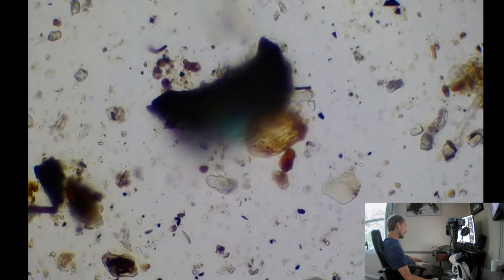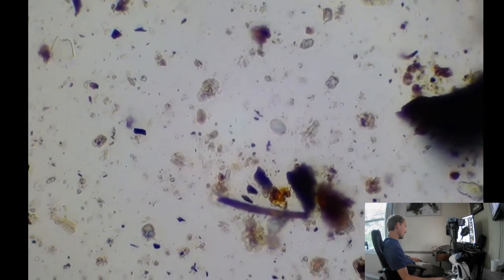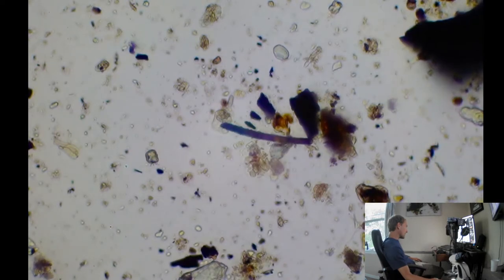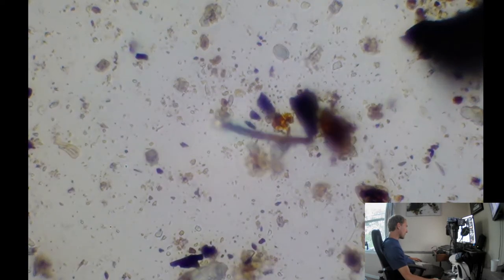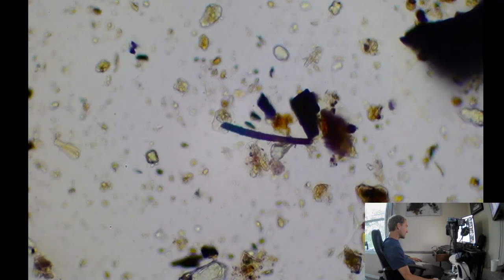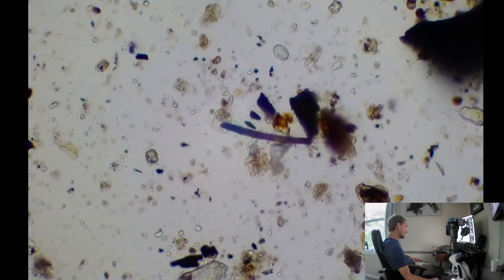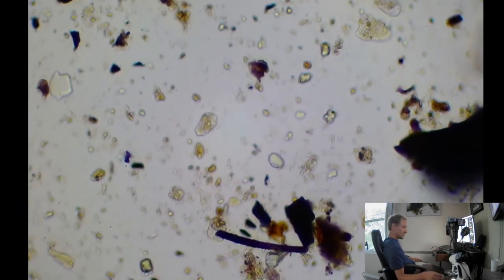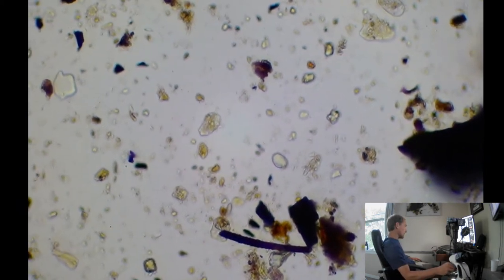Fortunately, right over here, that's more like what we want to see. Nice brown color. It's too small to see the septa. It's too dark and colored, but it could just be a piece of a root, but that's the color we're looking for in the fungi.